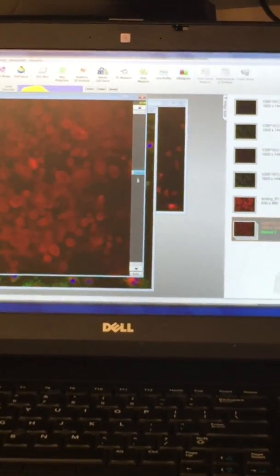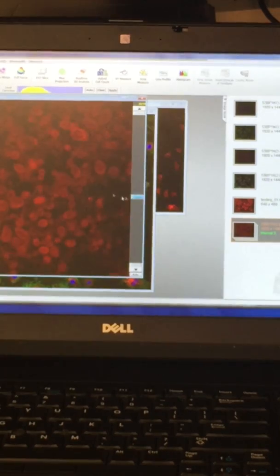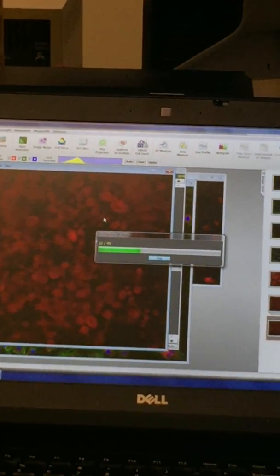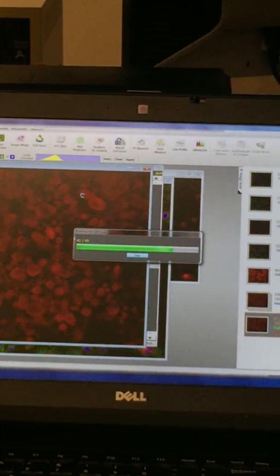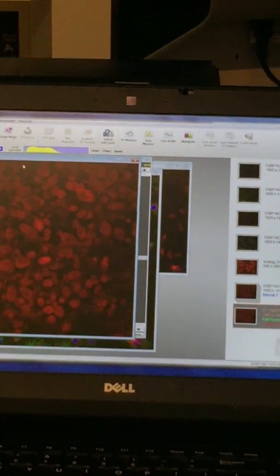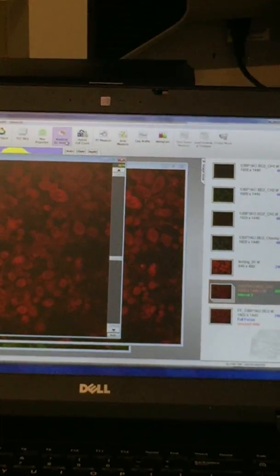So here's how to do your Z-Stack. You can also do full focus of this and then just click normal images. Basically how we did that quick full focus live time in the system, that's just what it's going to run with this stack right now. Okay, so here's this. Also what you can do is go to real-time 3D analysis, and this is going to create a quick 3D rendering for you guys.